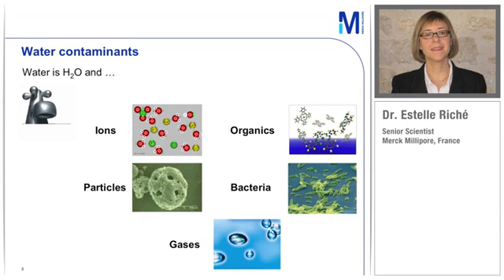Your water may also contain some organic molecules that come from nature. As leaves and pieces of wood degrade into water, they release some organic molecules. There may also be some very small amounts of other contaminants that come from human activities, such as pesticides or maybe plasticizers or even medications might be present now in tap water in very, very small amounts. So it is not bad for your health. However, it may have an impact on your experiments in the lab.